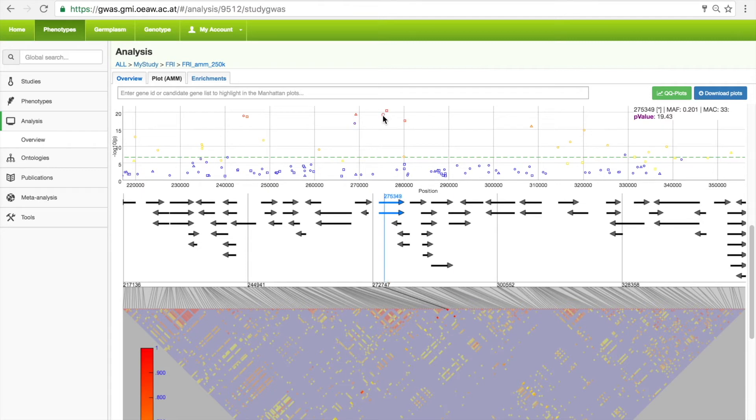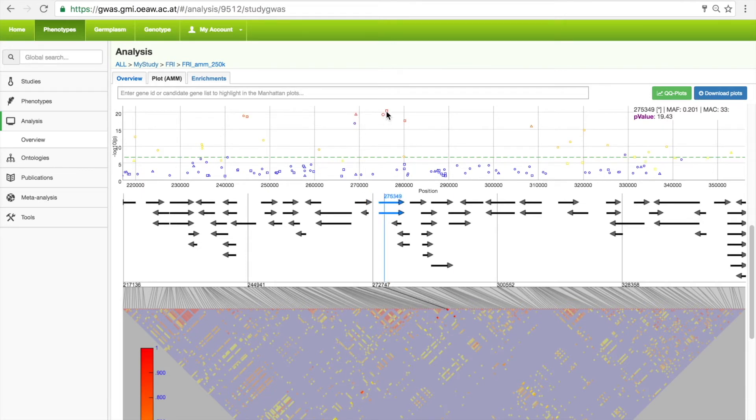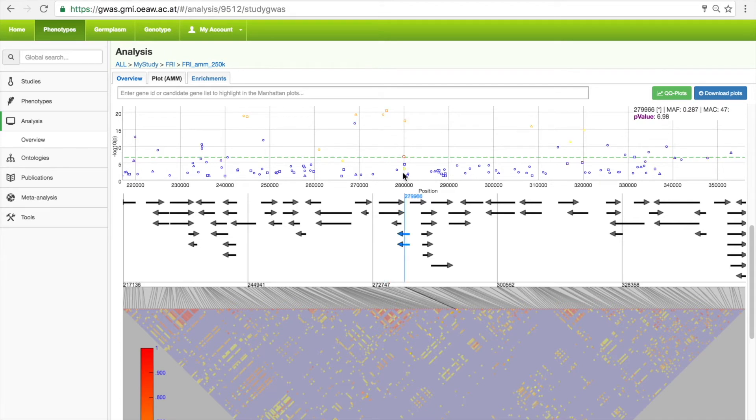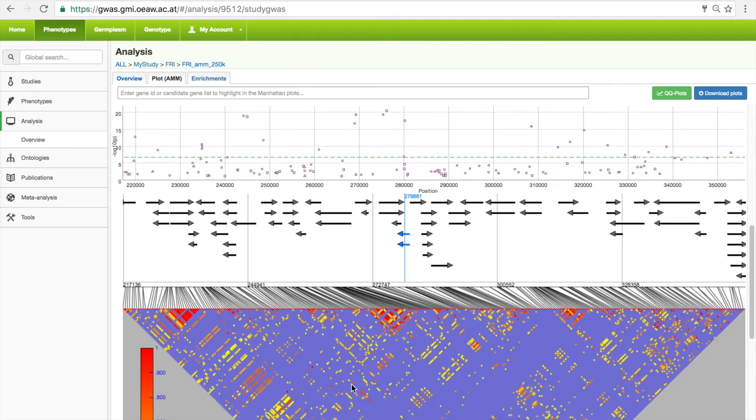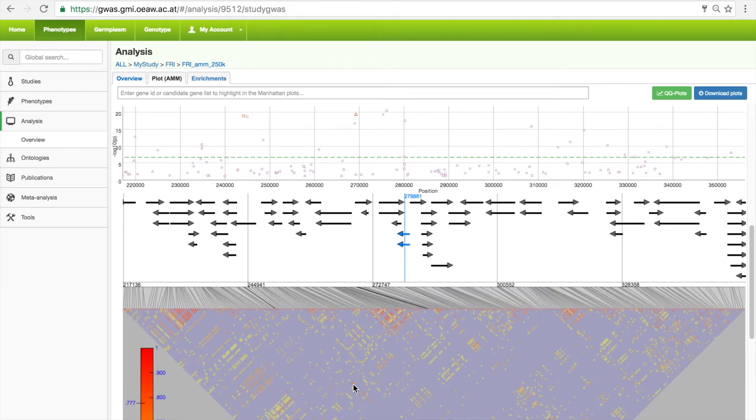There are two ways in which the user can interact with the visualization. Hovering over a marker in the Manhattan plot color codes all surrounding markers based on their LD, with red indicating strong linkage. Hovering over a data point in the triangle plot will highlight the two corresponding pairwise markers in the Manhattan plot.